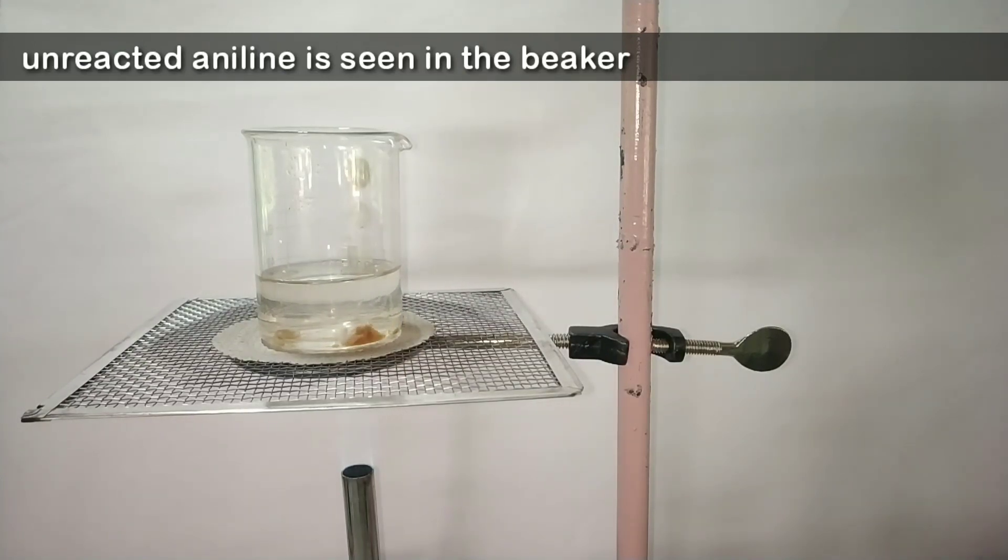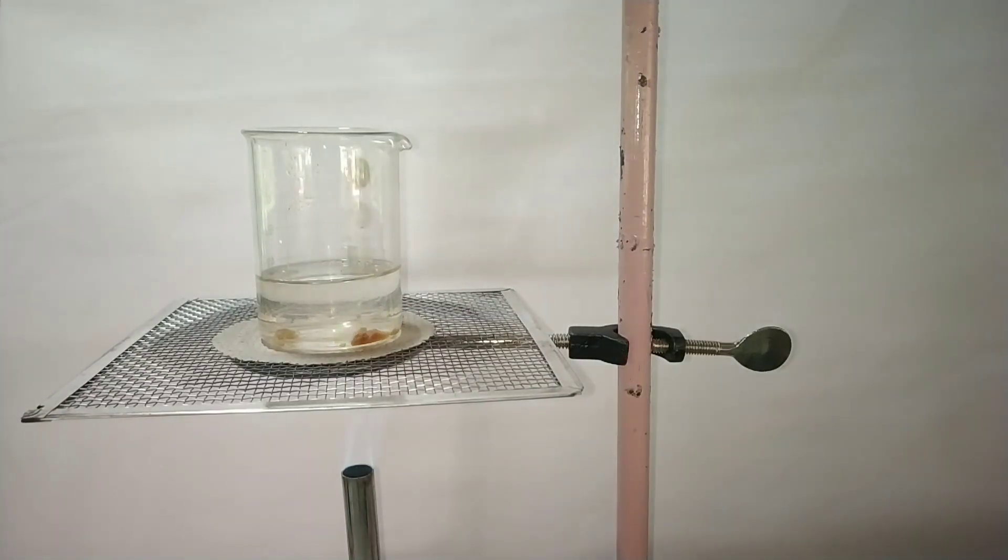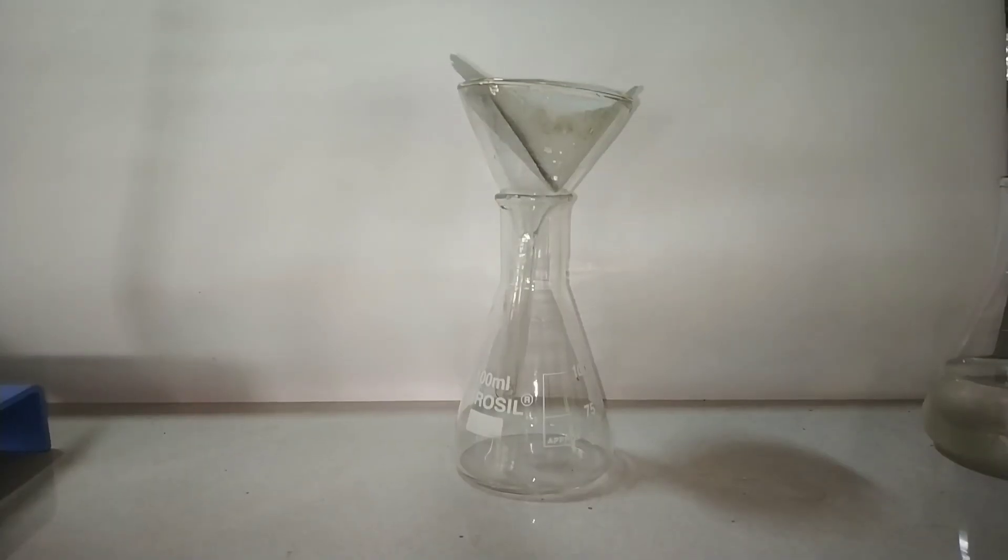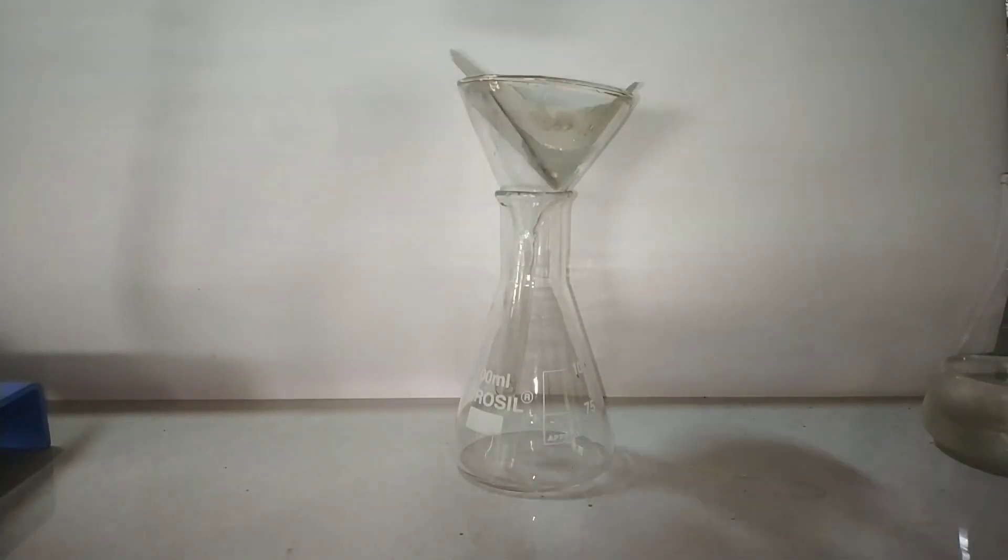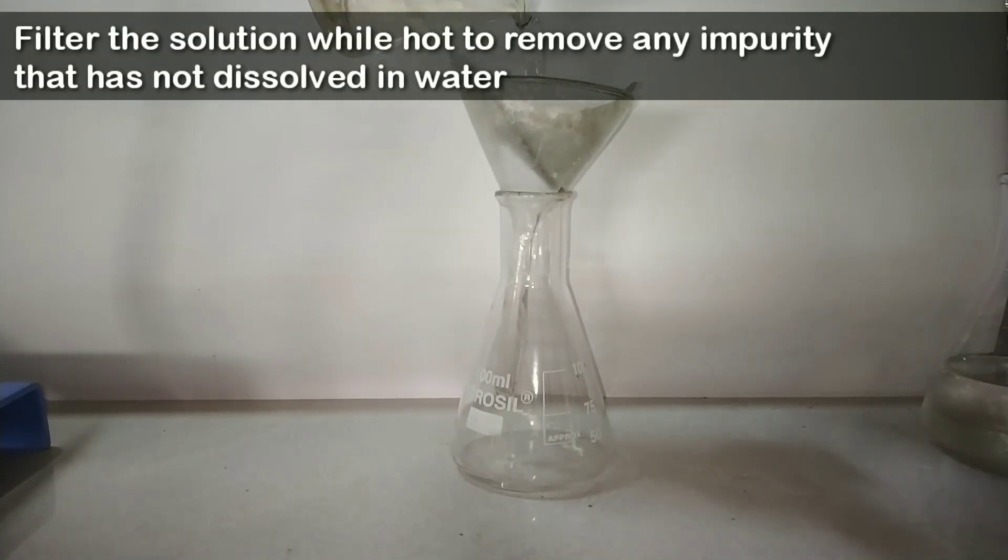But you see some jelly like solid in the bottom. I assume it is the unreacted aniline and I removed it. Now I filter the solution while it is still hot to remove any undissolved substances.